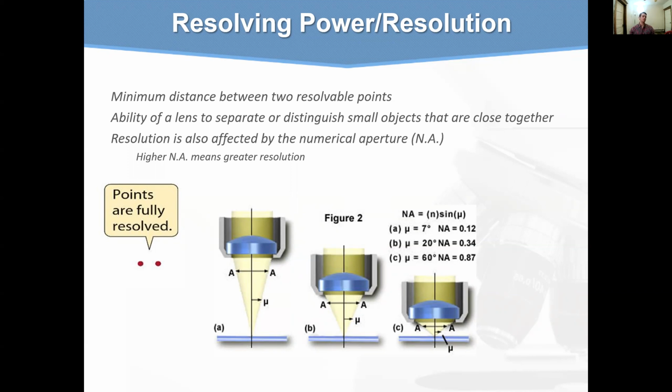The numerical aperture of a microscope is the measure of its ability to gather light and then resolve the fine specimen detail while working at a fixed object distance. If you look at this equation down here, just a couple of definitions, because that's how you can calculate your numerical aperture. This symbol that you see over here equals 1/2 of the objective's opening angle. You can see it over there. Your angle is half, so that's what it refers to.